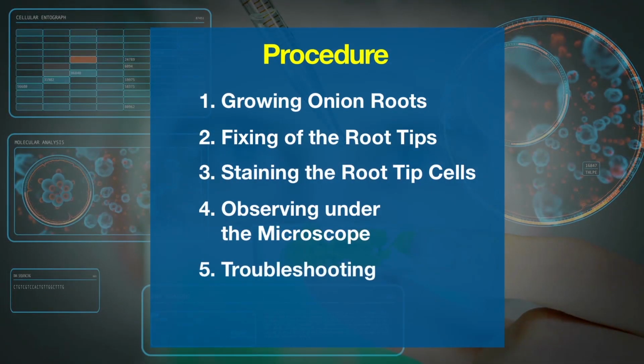Next is troubleshooting. If the slide is not satisfactory and the stages of division are not clearly visible, repeat the above procedures.